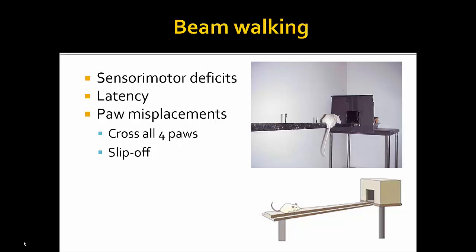We currently set up a camera, so now, yes, we can watch them on the video. We also time them during the test, because it's very simple. It's very straightforward. It's not a lot of watching, but we do both. So you can do either or. We've not set it up, but you could maybe set up a program, like a maze or something like that, so it can automatically calculate the time they take to go across the beam. I just don't know how it would work with foot placement. That might be something you would have to watch physically.